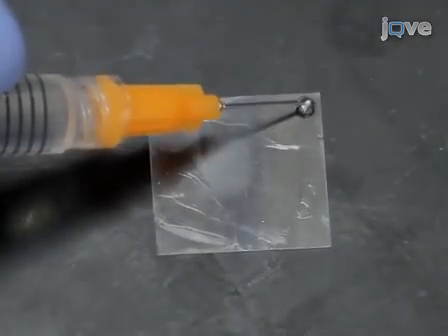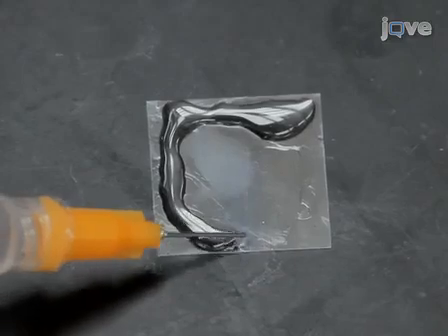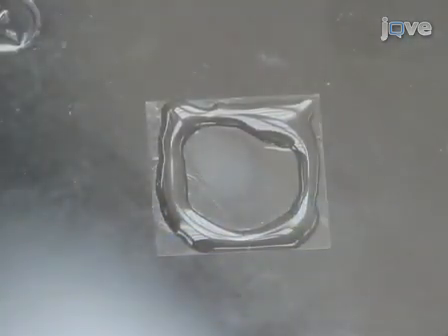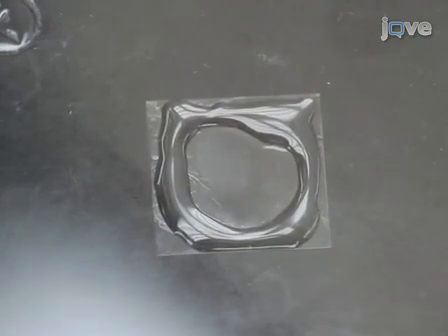Following spinning, pipette a line of PLGA around the perimeter of the cover slip, essentially placing a moat around the electrospun samples. Allow the PLGA to dry. This will maintain the alignment of the fibers during culture.